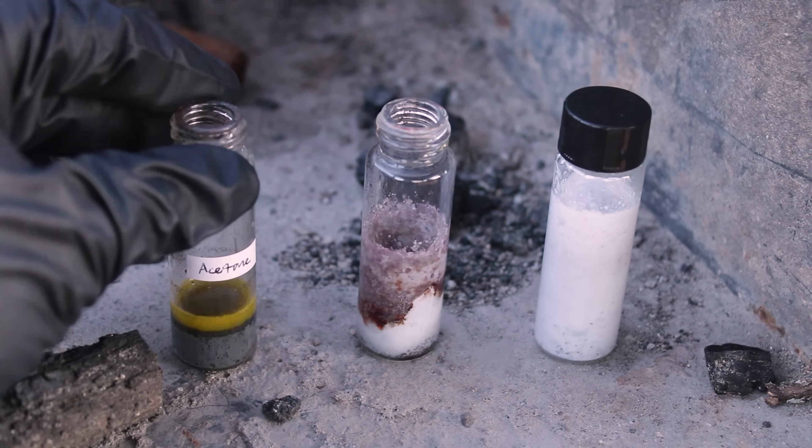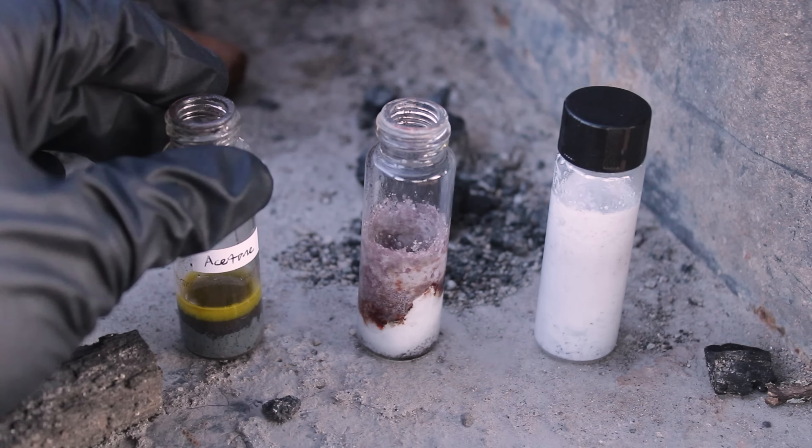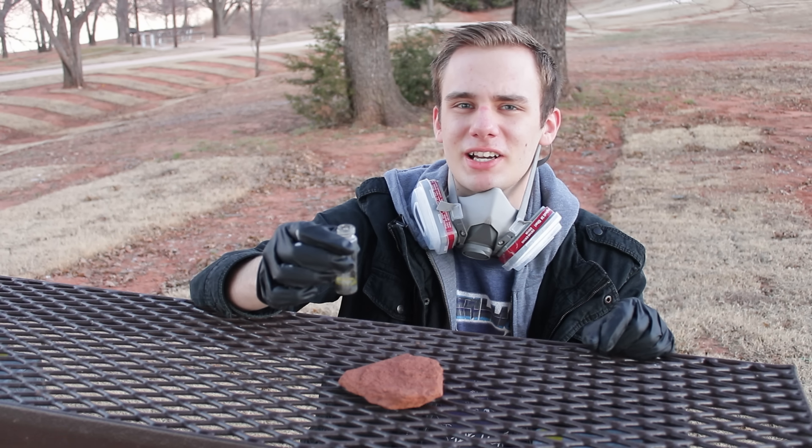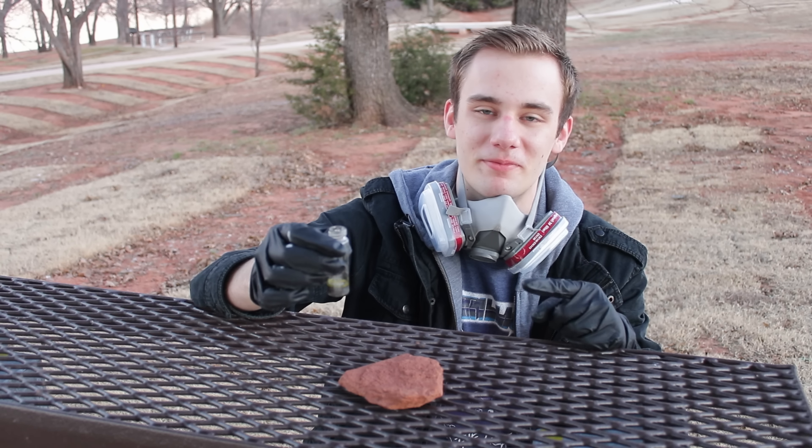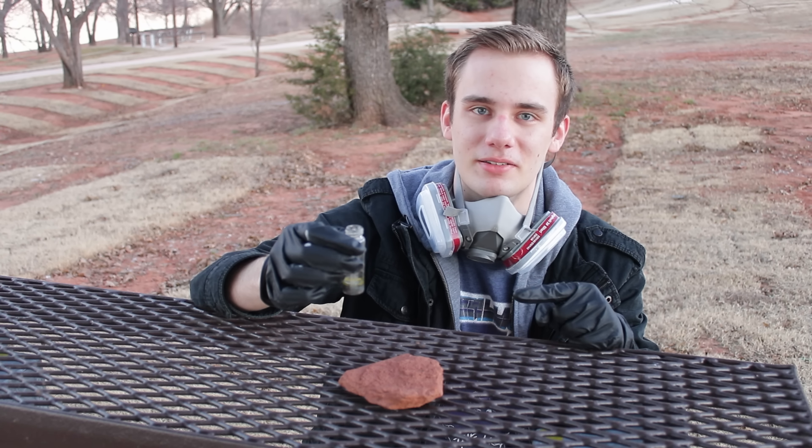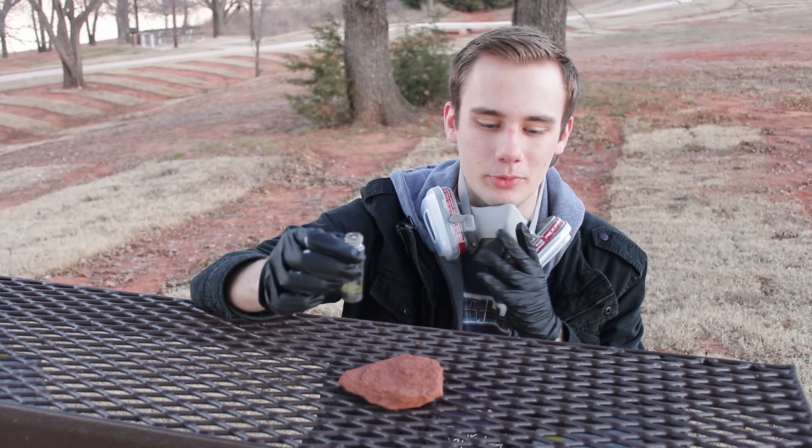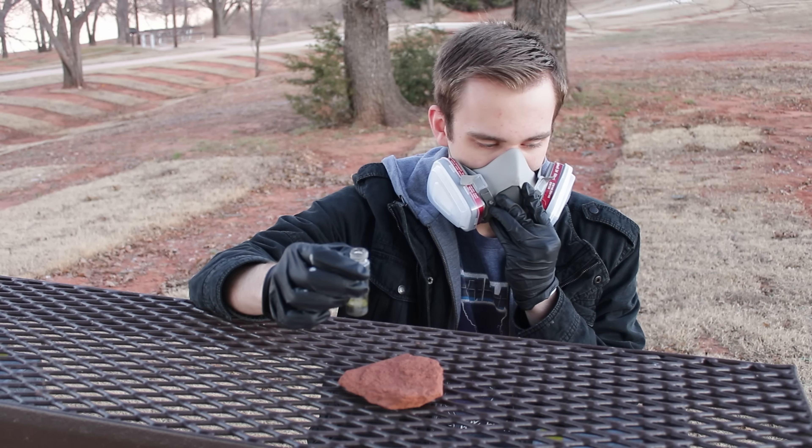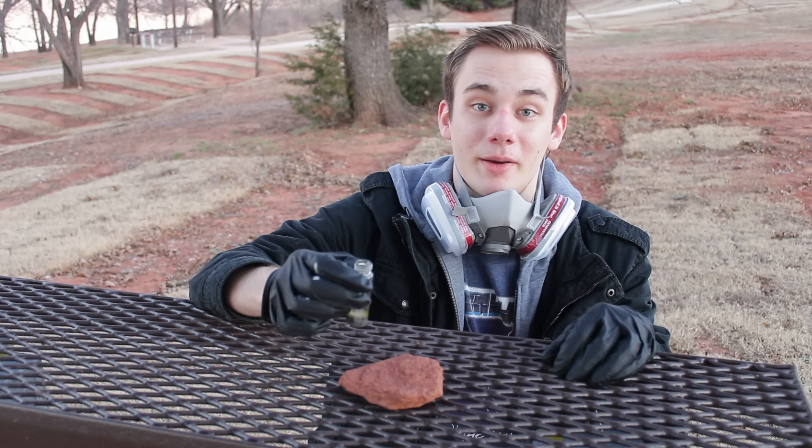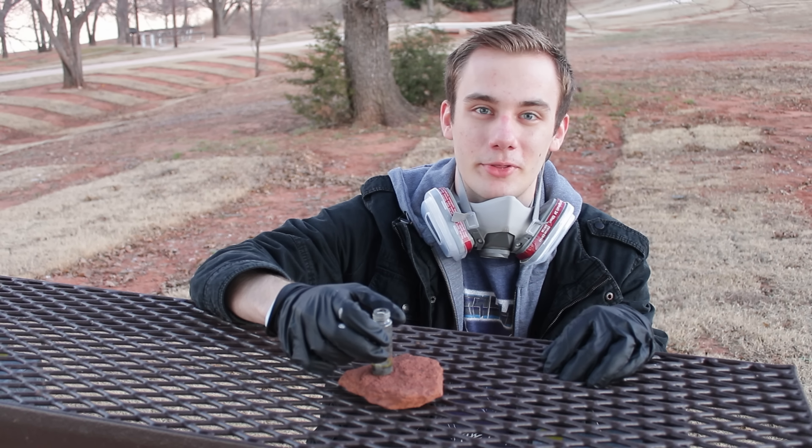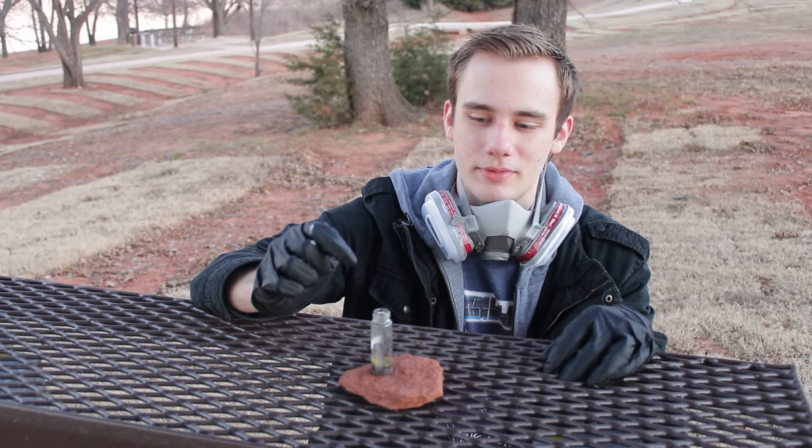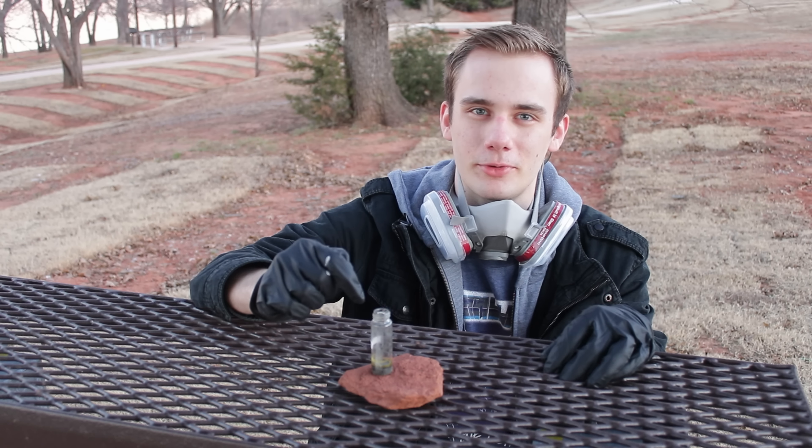After all the waiting and preparation, it was finally time for me to take off my mask and see just how bad selenium could possibly be. Spoiler alert, it was pretty bad. I'm gonna make this brief because I want to put my gas mask back on, but this is way more offensive than thioacetone. I am not making this up. This is my genuine reaction. Last time I kind of played it up a little bit for the thioacetone. This is 100% genuine. This is absolutely awful smelling.